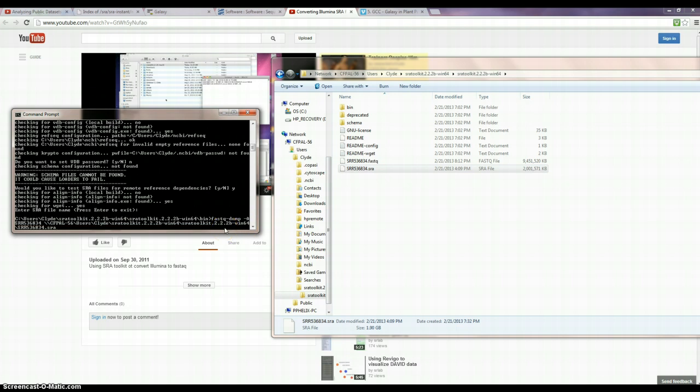That tells it the source path, right? Directory route, or whatever you want to call it.